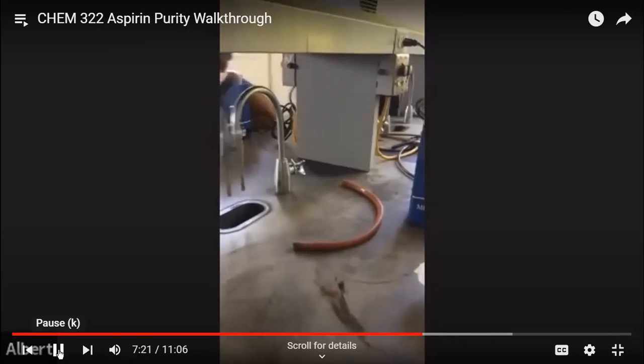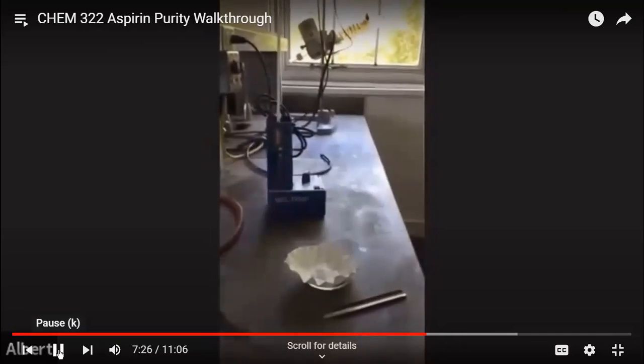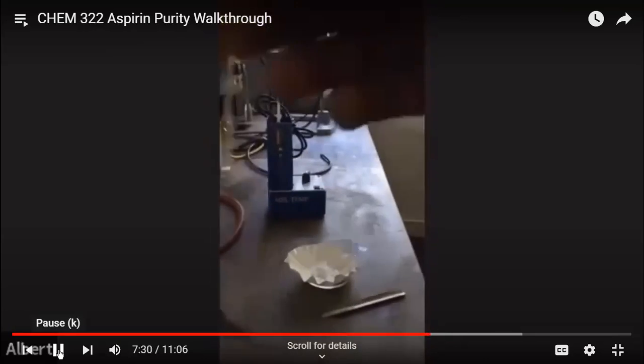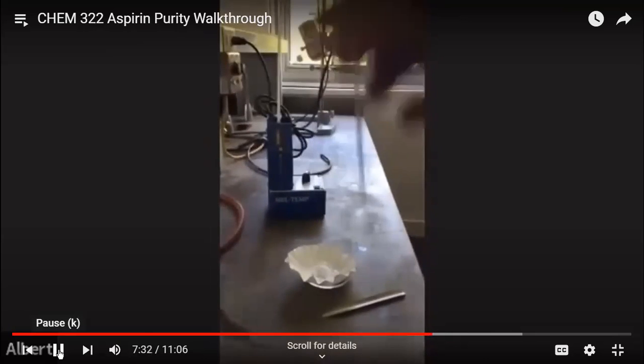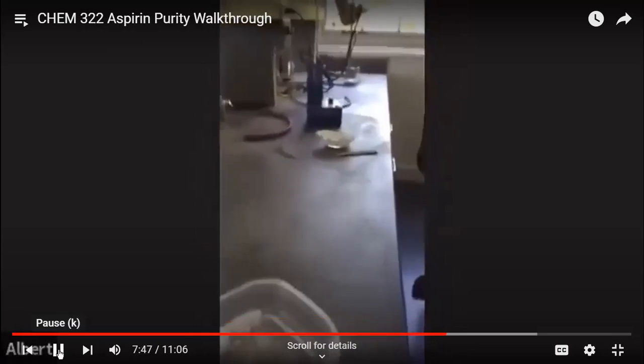All right, so we're going to take some sample and I'm going to show you this. Normally, you have a tube that you can drop your melting point capillary down in to get the aspirin to settle. What you don't want to do is jam it into the aspirin, because if it gets stuffed, it's not going to go down. So let me show you what to do first and then we can take it from there. This thing needs to turn down more.